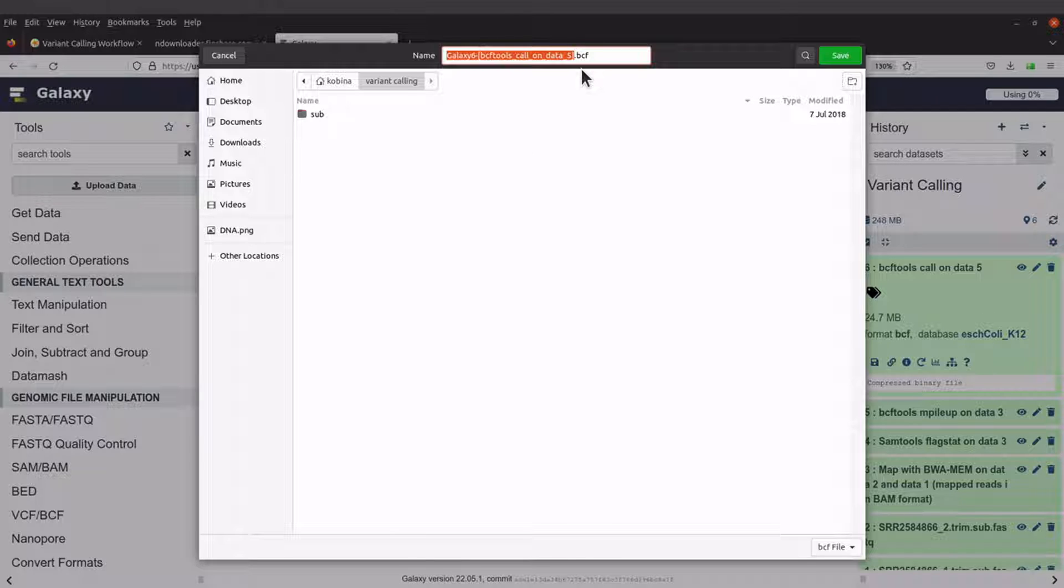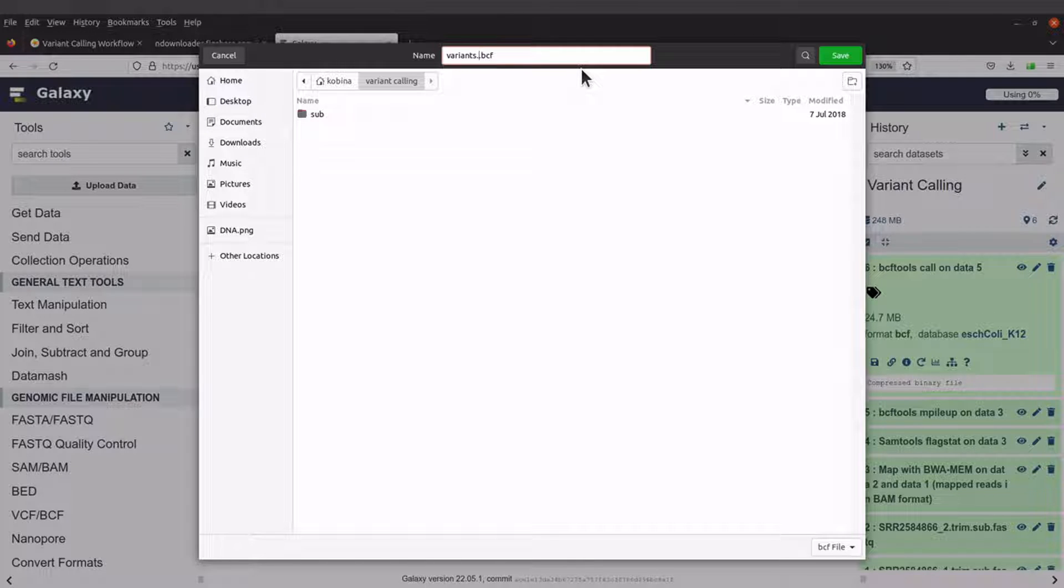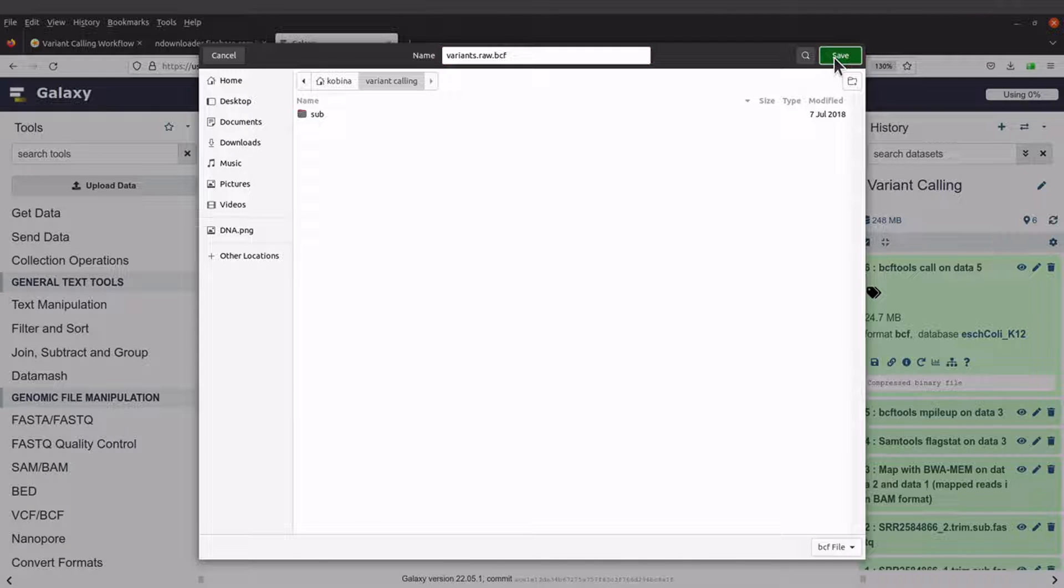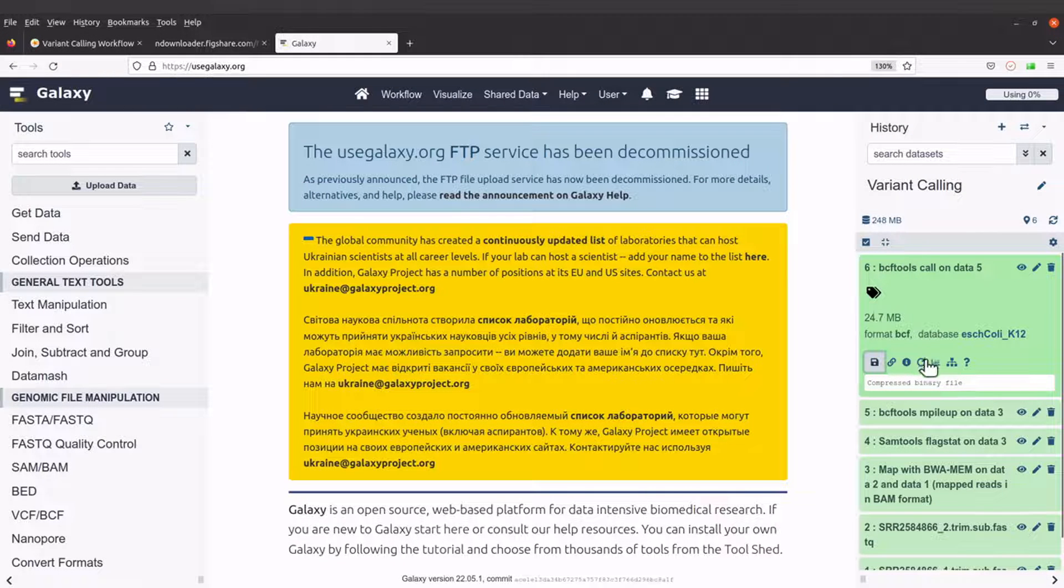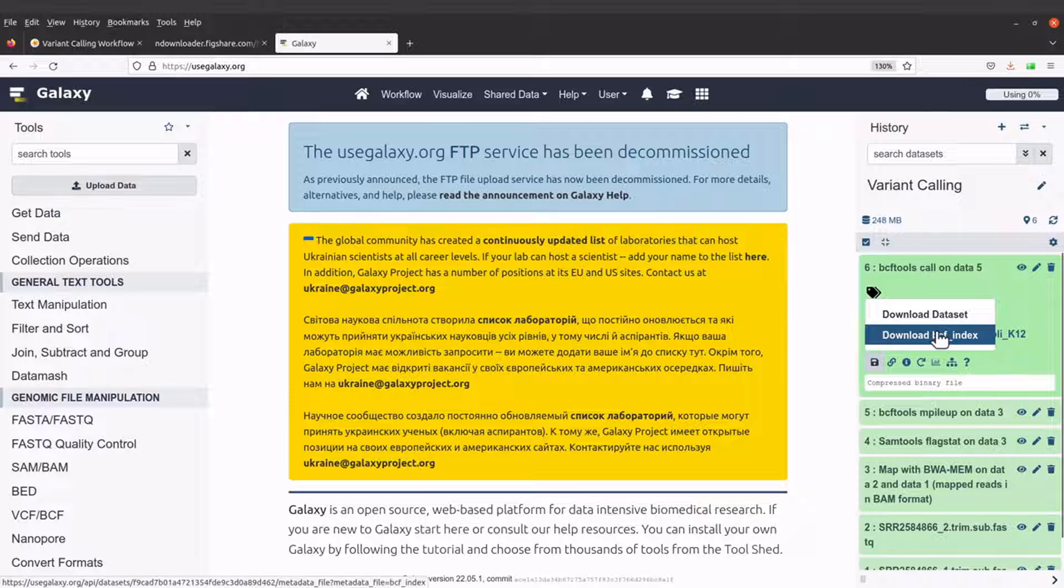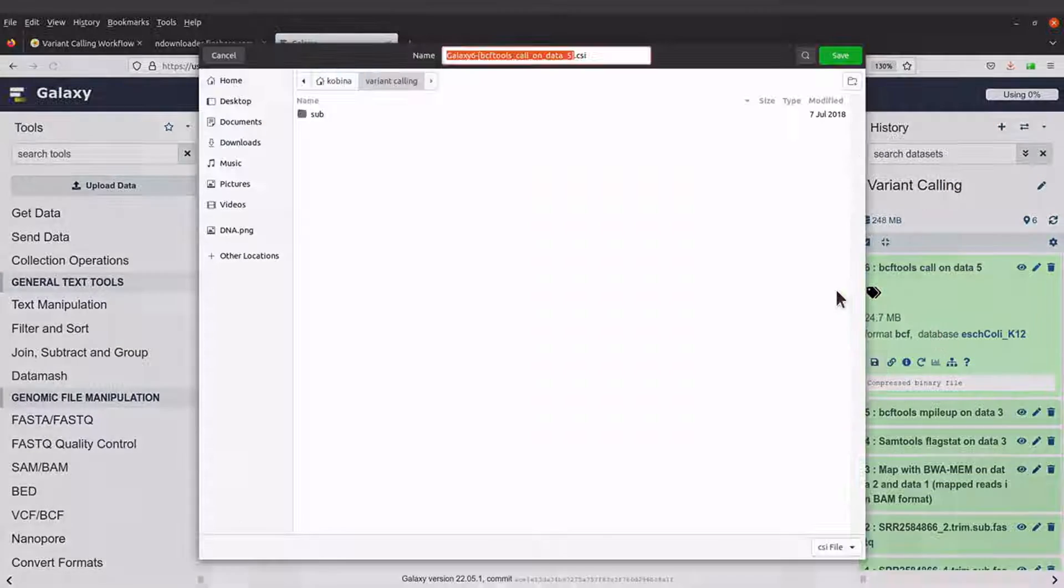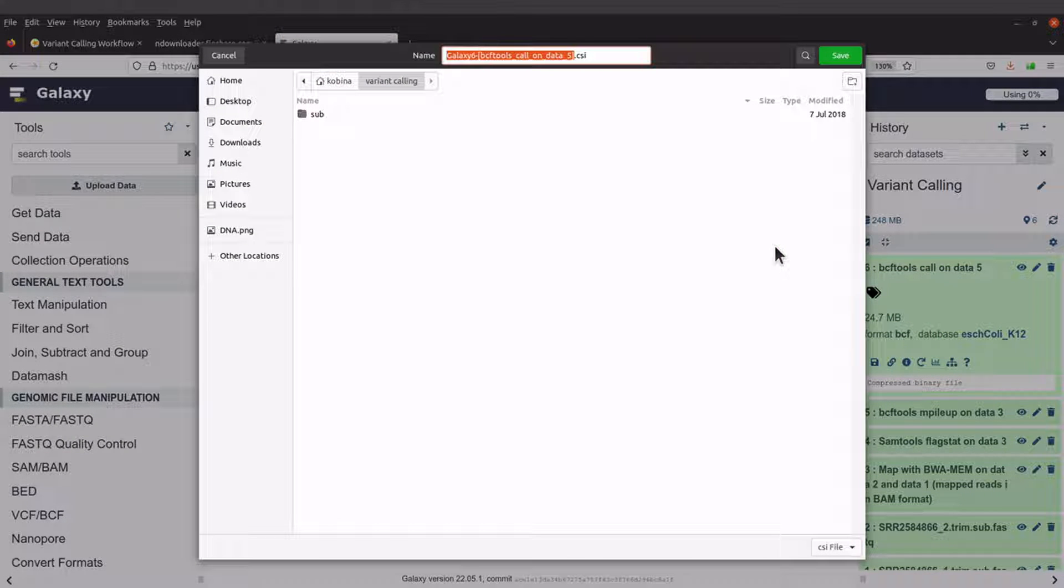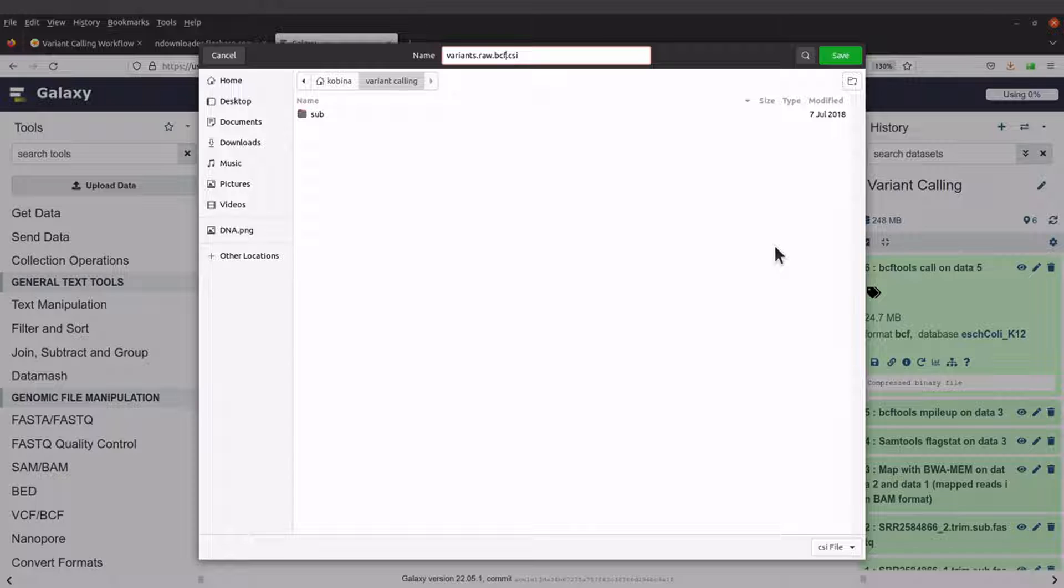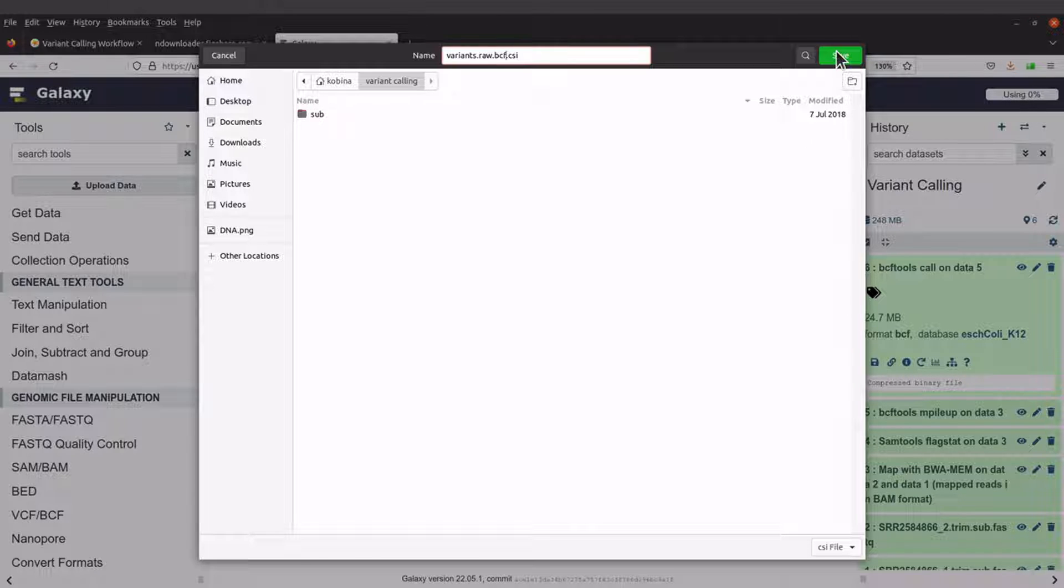So I'll name this as variants.raw.bcf. That will be the name. I'll download the index file as well. I'll say variants.raw.bcf.csi. That will be the name of the index file.